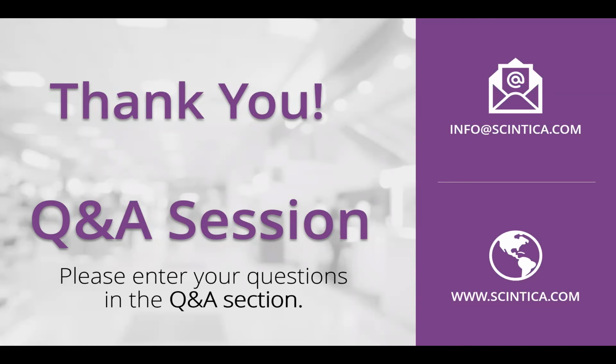Thanks for the answer. The next question is, can I use bioluminescence imaging to image transgenic tumor models? Great question. So again, if we recall moving back to the bioluminescence imaging, we have to have cells that have been manipulated in some way to express luciferase. So that when we inject the luciferin or other substrate, depending on which luciferase you're using, that they can interact. And so transgenic models, as we know, are spontaneously occurring. We don't cause those cells to be manipulated in any way.